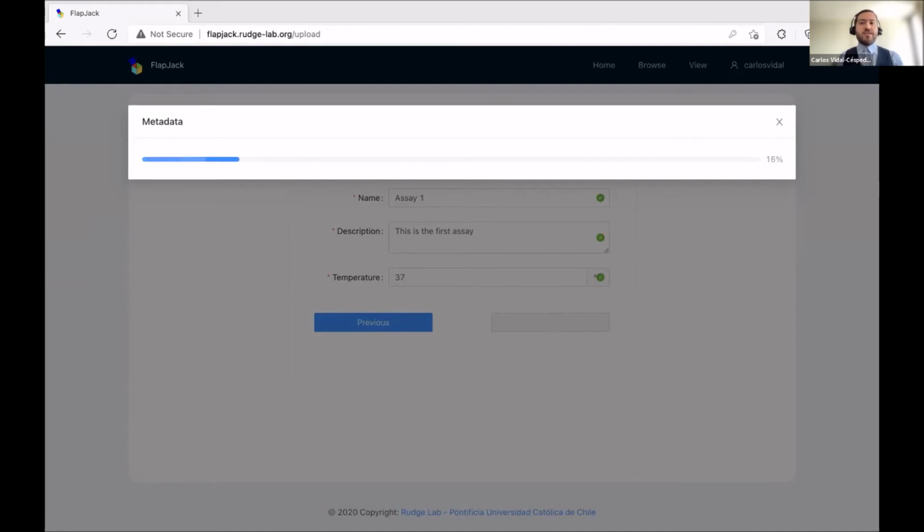Are there any questions for the moment while we wait for the file to upload? Okay, I guess there are not.